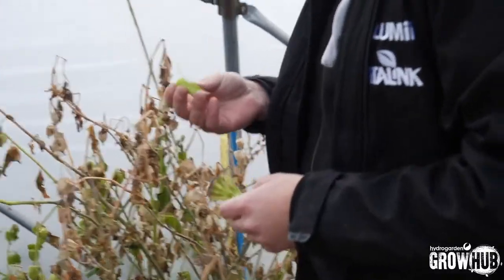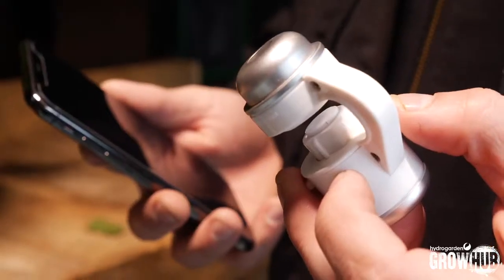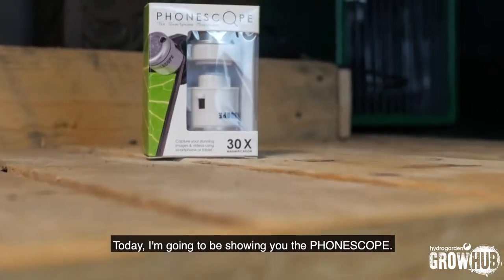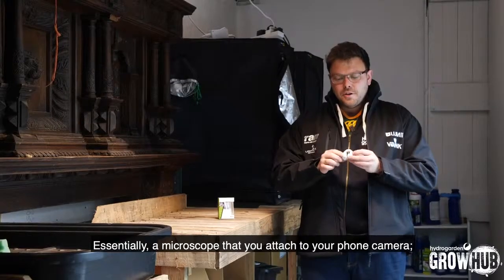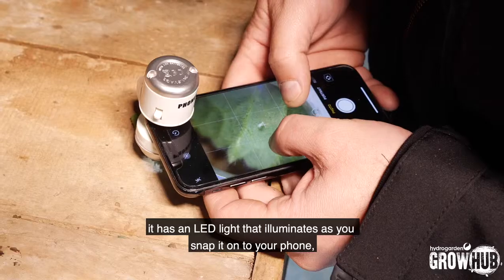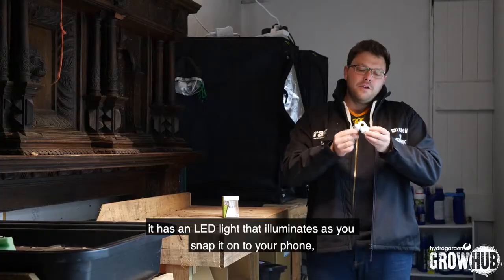Hey guys, and welcome to the GrowHub. Today I am going to be showing you the Phone Scope — essentially a microscope that you attach to your phone camera. It has 30 times magnification and an LED light that illuminates as you snap it onto your phone.